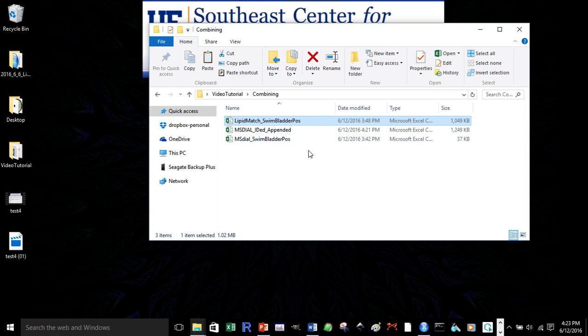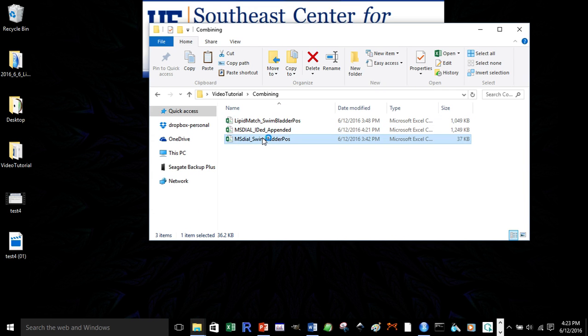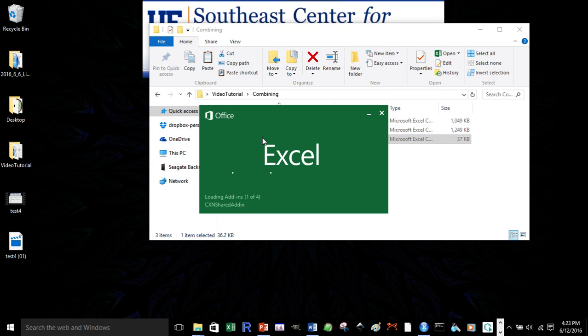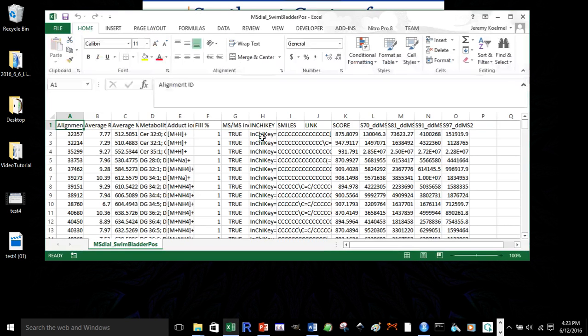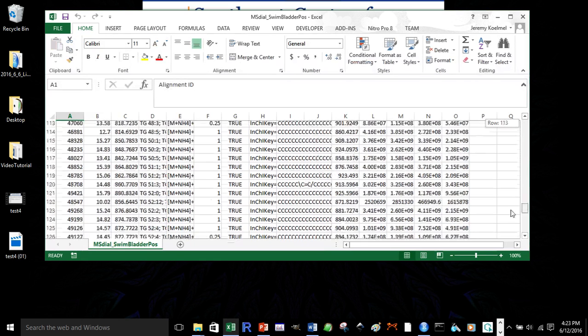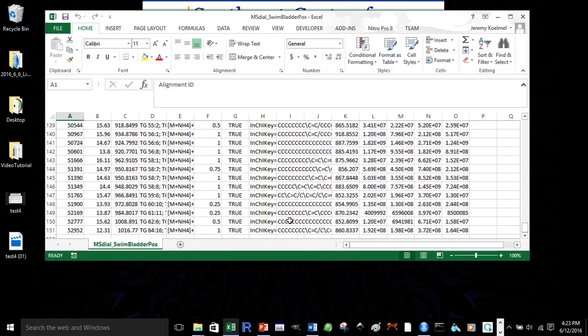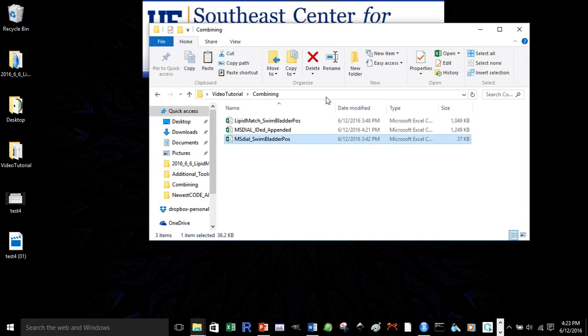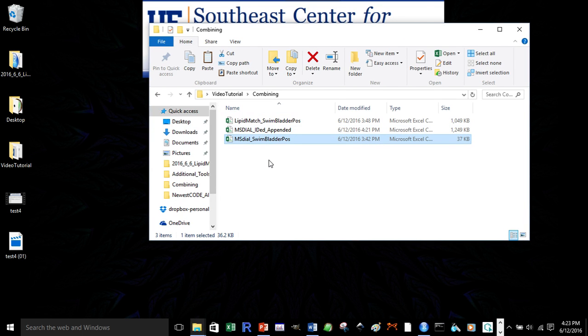Now, if we look at MS dial, we were able to identify 150. So, more than two times the number of features were identified in lipid match versus MS dial using the same data on swim bladder tissues, which are fish tissues, to stay afloat.